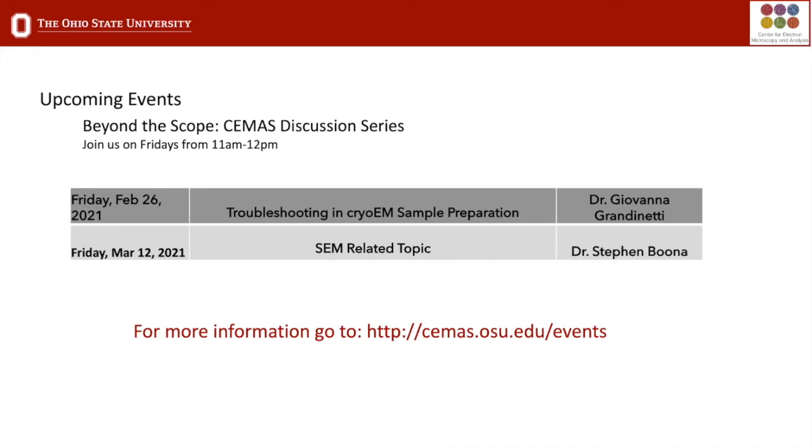But there's still a real need. We can produce really, really good data. What we need is to better understand our data and process our data to a certain extent. When you look at one of these columns, we want to be able to tell you what the composition of the column is. But unfortunately, we don't know how to deconvolute out all the signals, even in EELS and EDS yet. We've put error bars on it, but we'd like to reduce those error bars. So there's some real theoretical work in understanding the microscope, as opposed to technological advancements that need to come.